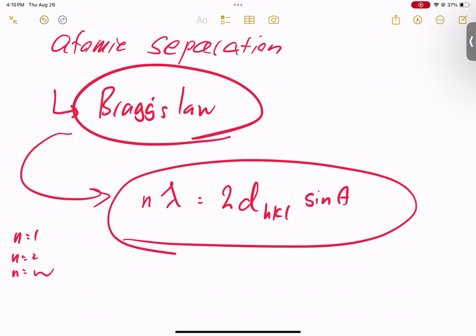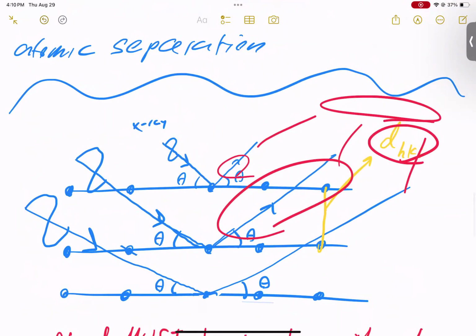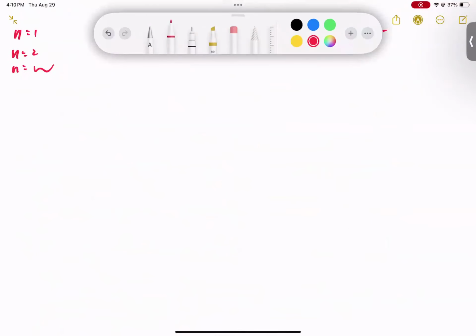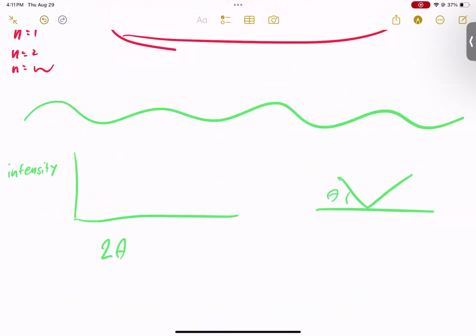All right, what's next? So this essentially describes what happens during X-ray diffraction. Let's look at what results from X-ray diffraction may look like. Let's do this in green because I feel like it. So the results from X-ray diffraction may look like this. You're going to have a graph that says intensity over here and 2 theta. The reason why it's 2 theta is because when it comes to specular reflection, we have angle theta, angle theta, so combined the two is 2 theta.